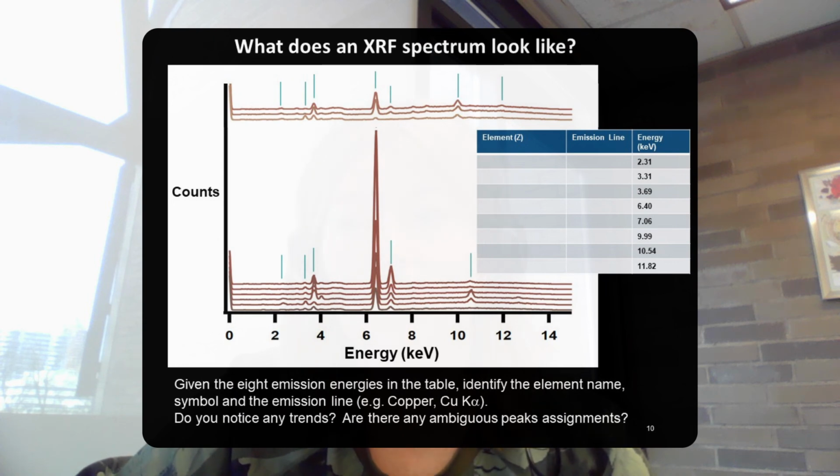Shown in this figure are 8 separate XRF spectra. They are displayed in what is called a stack plot. Each spectrum has been shifted upward so that they do not appear vertically on top of each other. Notice too that the axes are clearly labeled with titles and units. This is a clear way of displaying the data.